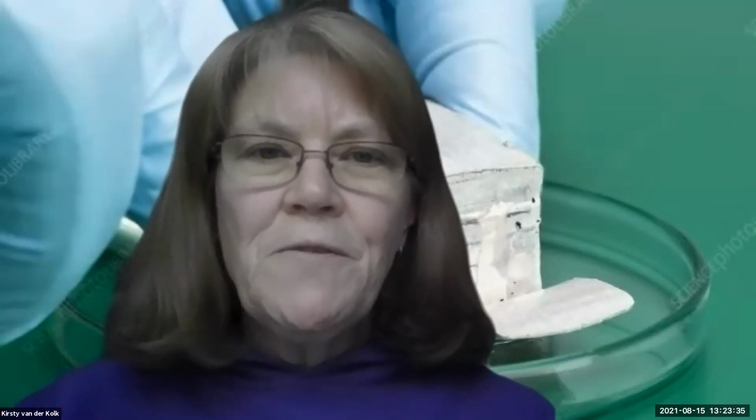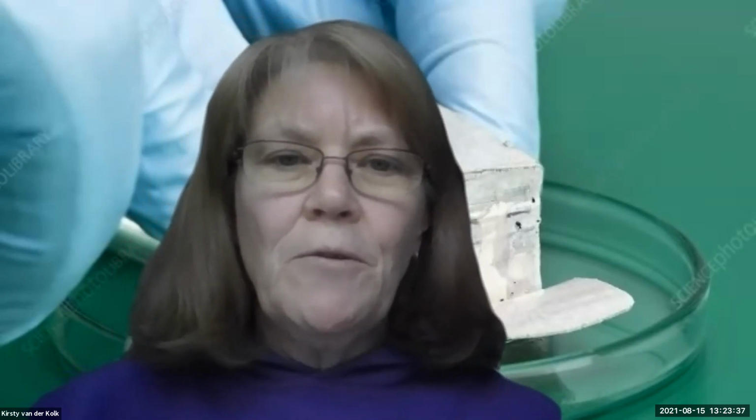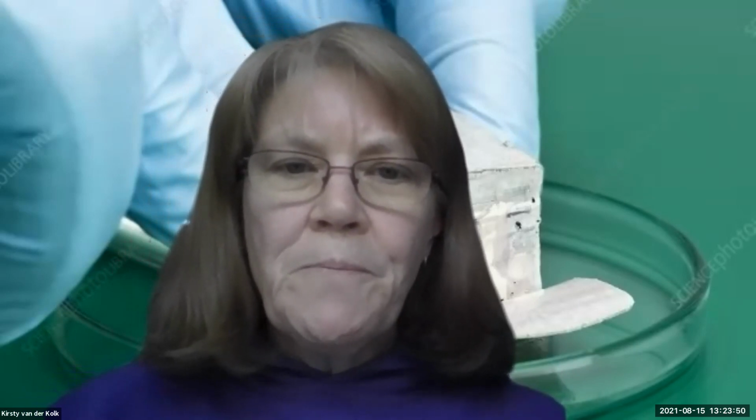Hi everyone, Mrs. V here, and today we are going to look at our first video in the chemical properties of alcohols, in which we look at the reaction between alcohols and sodium metal. This is an important way to test for the presence of a hydroxyl group. So let's cut to our PowerPoint and learn some more.